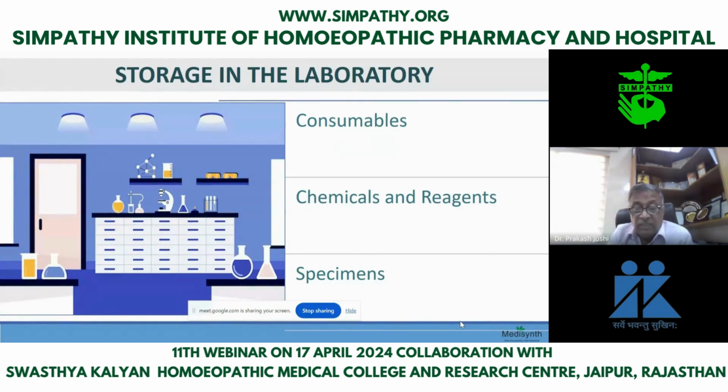And Berberis vulgaris and aquifolium, you have the bark. And secondly, Berberis vulgaris, as I told you earlier, when you see it microscopically, you get a lot of crystals in it. Raw material crystals are there, and those crystals are not there in aquifolium. So the specimens and the microscopic photographs help you, and whosoever comes after you, or whosoever students want to learn, you can tell them these are the ways to identify.